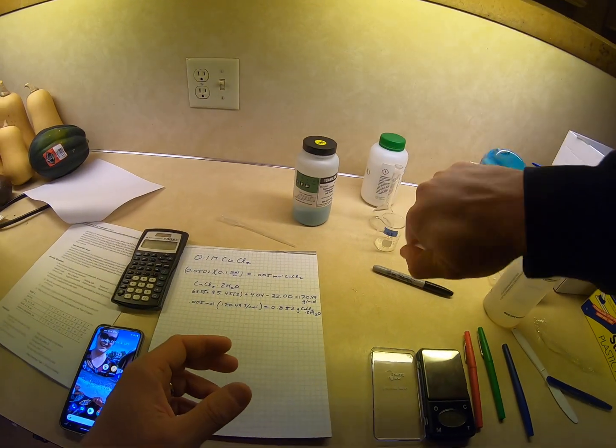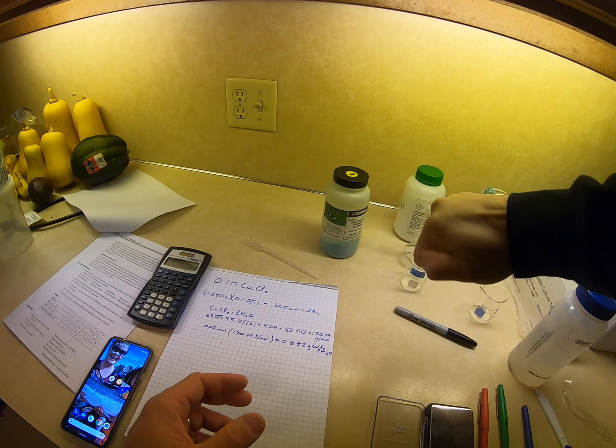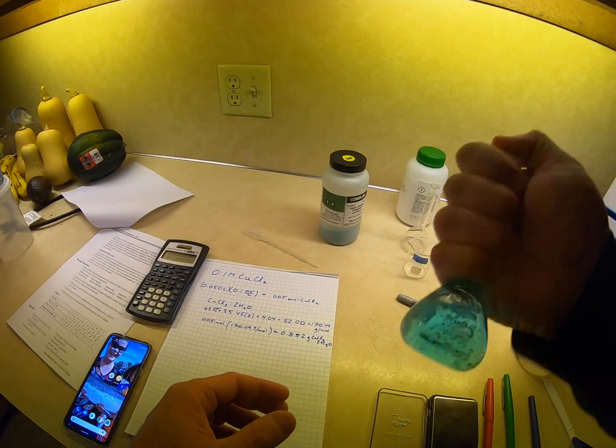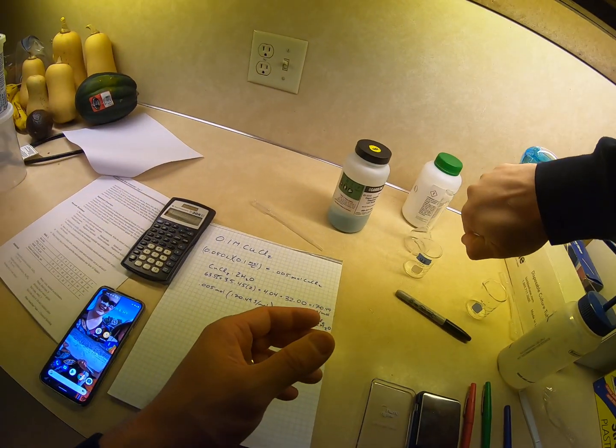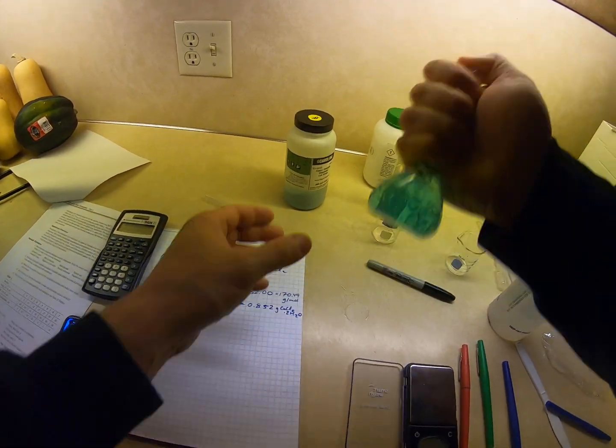Invert. All right, so this is 0.1 molar CuCl2. Let that dissolve.